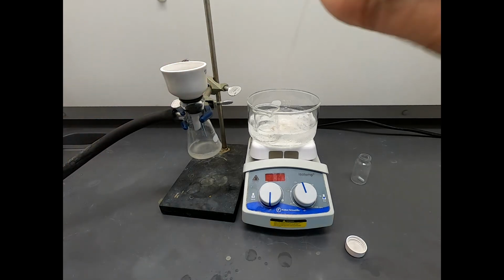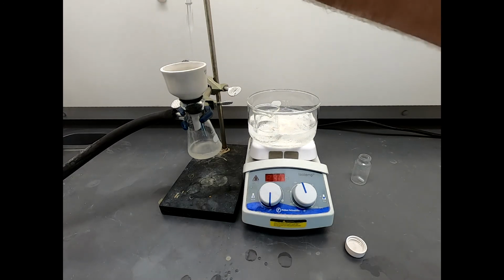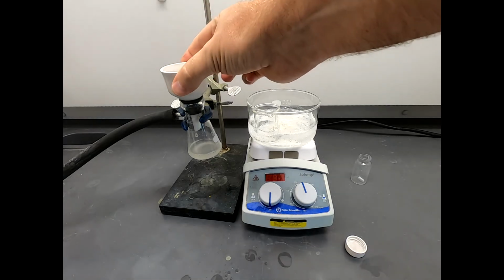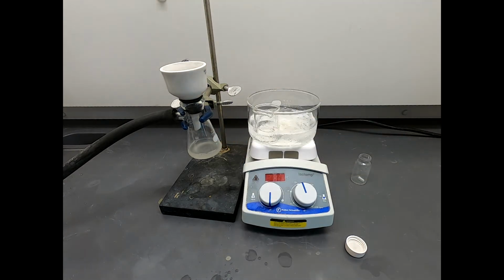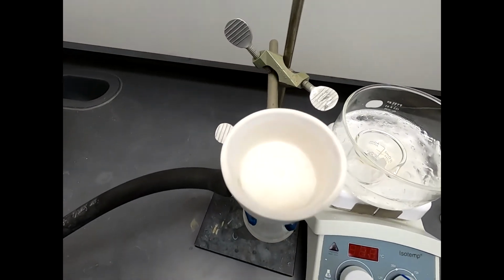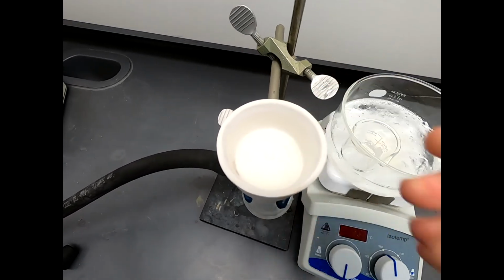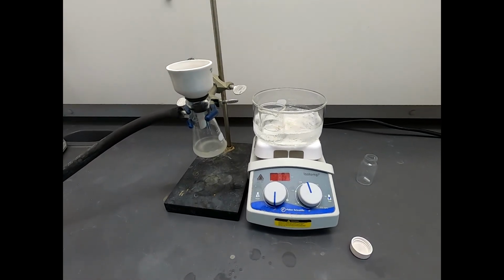Okay, so let's use our pipette and get just a little bit more water. Rinse that in there. We want to rinse it, but we don't want to overdo it, because with all that rinse solution that we put through there, we're potentially dissolving some of that product. So this is almost finished. Drawing through. Of course, you can watch it drip. I'm watching from the top of the funnel. And if we take a peek in here, there's not really much liquid in there. You can see where the solid has kind of piled up around the holes in the plate underneath the filter paper. Okay, that's it. So we filtered our product.